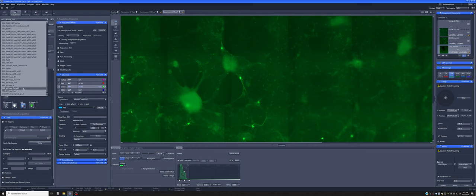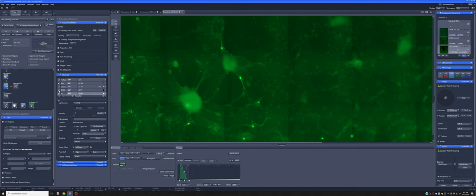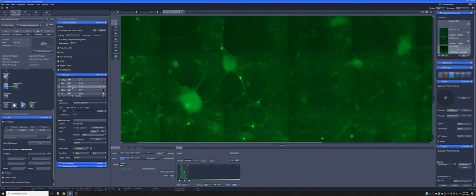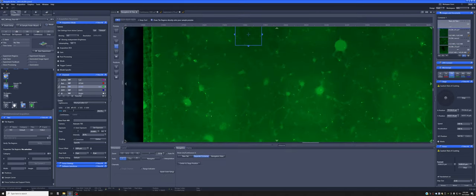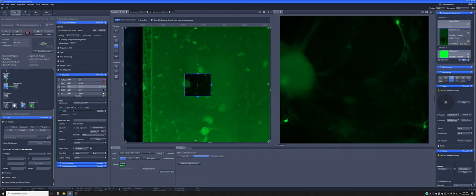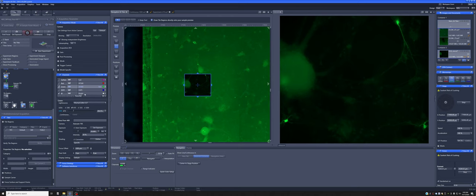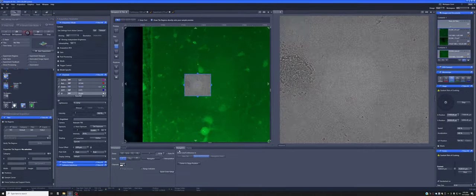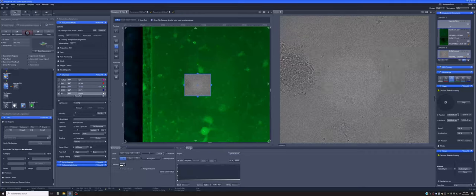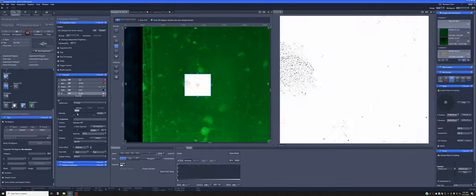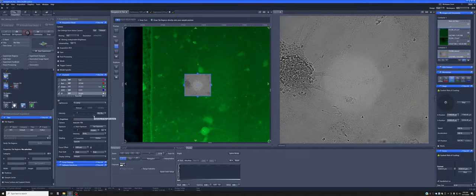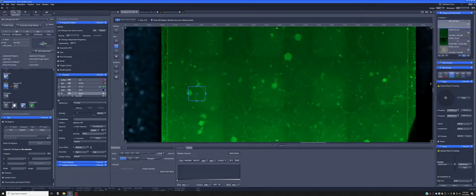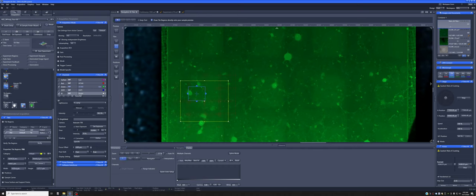So for example, if I load a setting, that's fluo, MSL map, fluo plus brightfield, I can just set up the green channel. Let's put, for example, go here and we'll make a smaller. Let's see, whoops, I was in the wrong one. So we'll go here. I'll leave this. I'm not going to crank up the led as much cause I'm afraid of bleaching. But I want to set up the brightfield. And so in this case, I'm going to increase the image intensity. So you can see that's pretty reasonable. So we could take, let's see another small area with both of those.